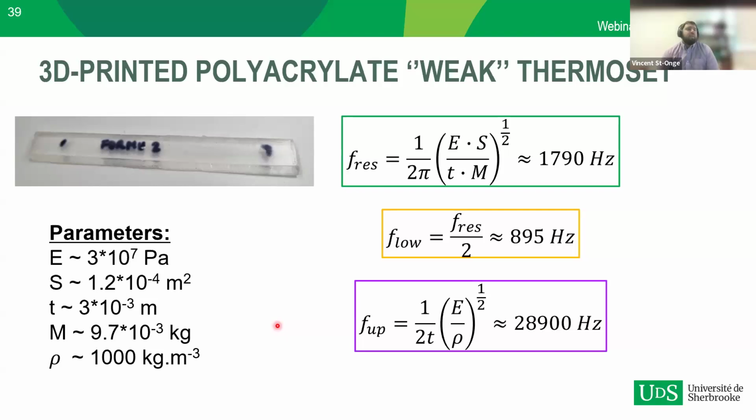We also use the instrument for teaching purposes. So we had the students in the lab replacing a typical polyacrylate 3D printing resin by a biosourced, still a polyacrylate, resin that would give something that would be labeled as a weak thermosetting resin. So the glass transition temperature would be higher than room temperature, but the sample would have relatively soft or weak mechanical properties. So again, this is the kind of sample that the student printed.